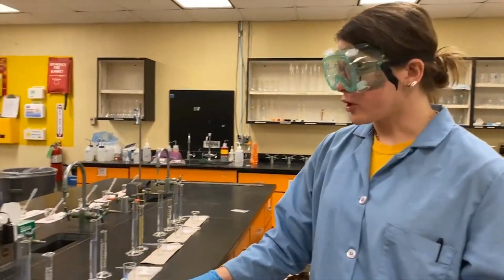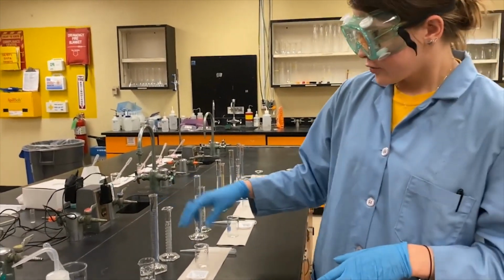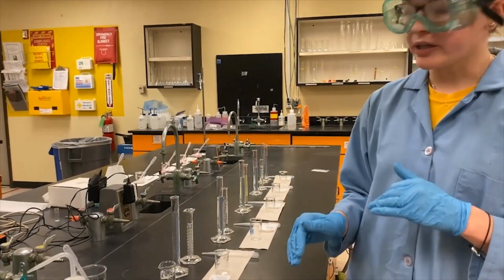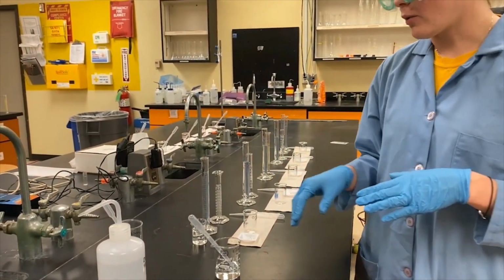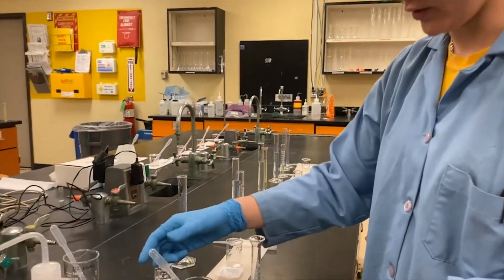So the next thing we're going to go ahead and do is actually mix together our solutions here. So for the 0.40 ppm solution, I need 1 milliliter of the 10 ppm stock solution and 24 milliliters of regular DI water. So I'm going to go ahead and pour the 1 milliliter first.